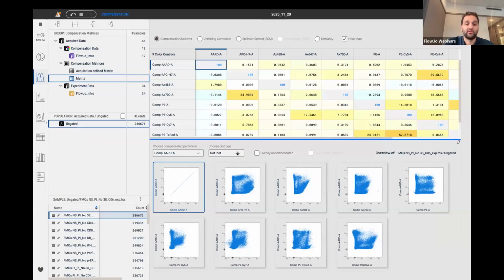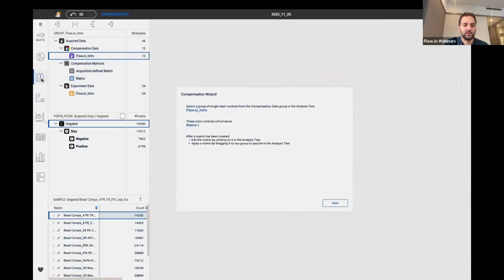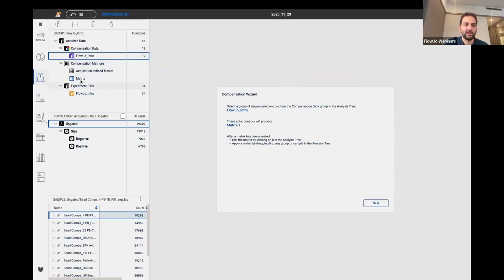And then for the visualization, we have updated the platform. So basically, you can use here below, we don't have the n by n anymore, where we see each parameter versus each other, but we select a specific parameter and show that one. Yeah. So for example, we'll go back here.